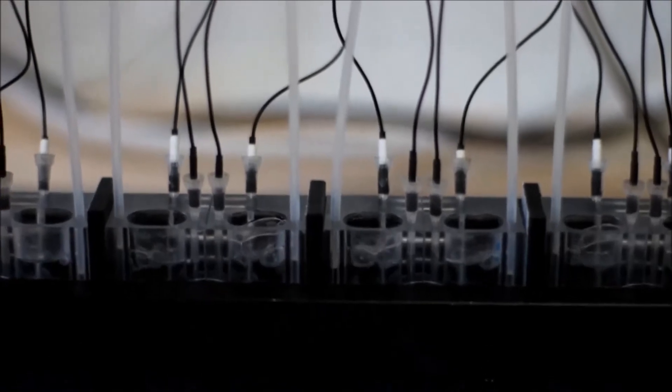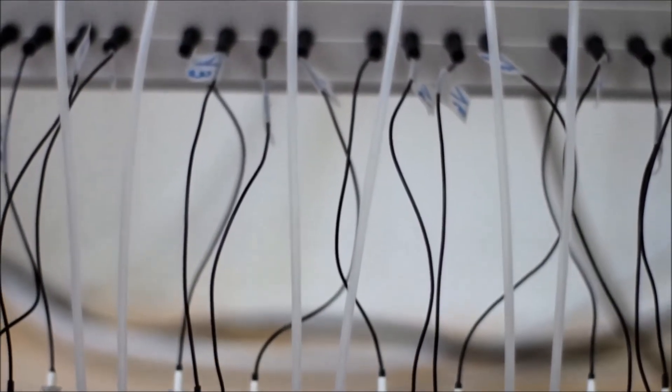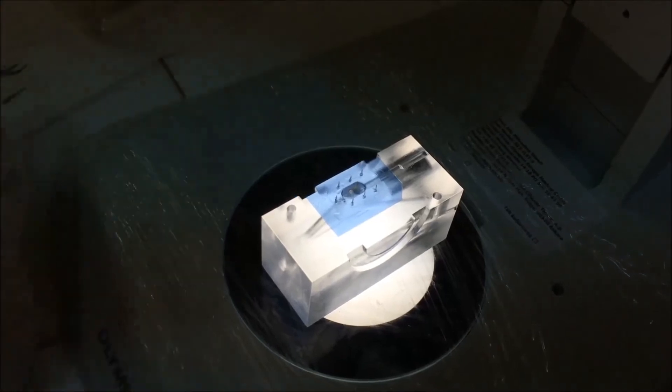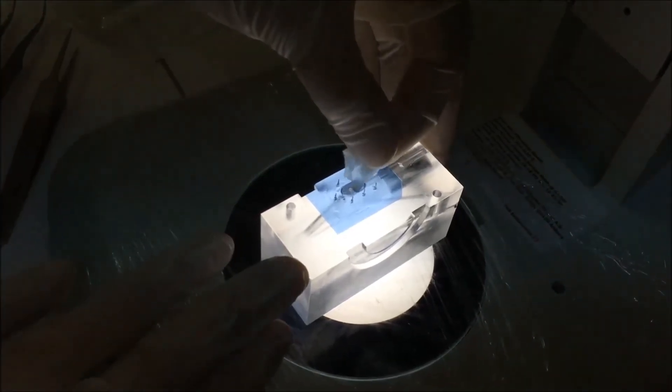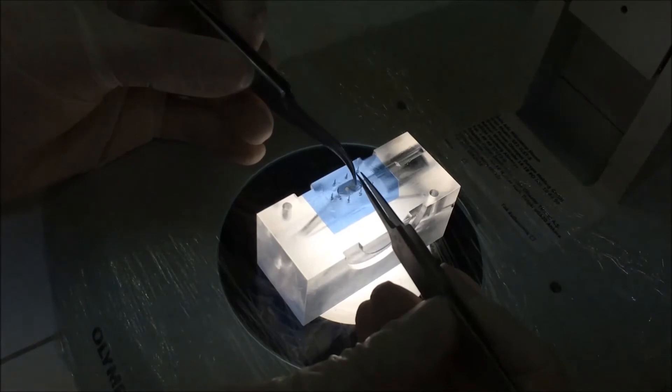The Ussing chamber system should be calibrated for 30 to 40 minutes. Aspirate the buffer, then mount the biopsy into the chamber attentively under a light microscope.